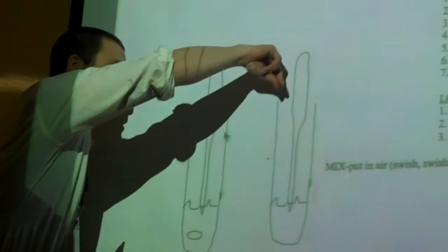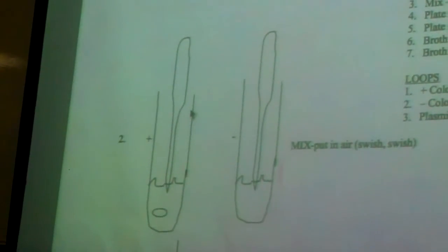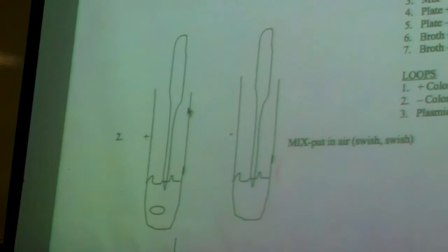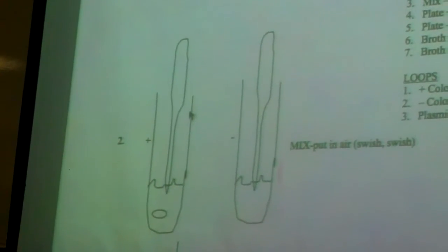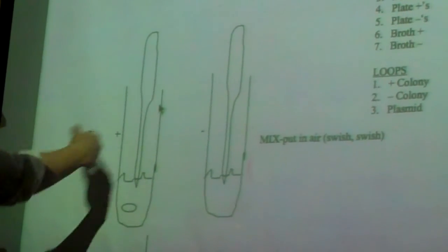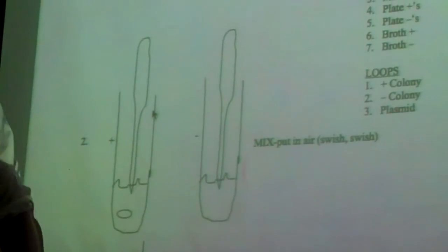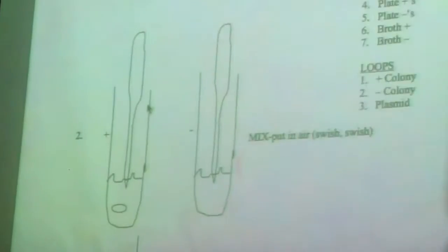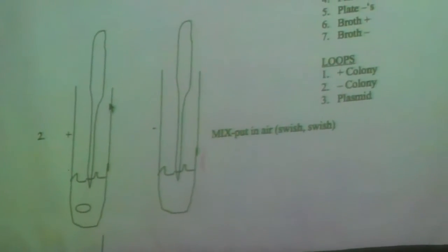Right, so why would I do this on the other one? Kind of keep it from settling. What's the word I'm looking for in experimental design? Constant. Constant's perfect. That's a constant. But this would also be our blank in this group here eventually. Control. Very good.